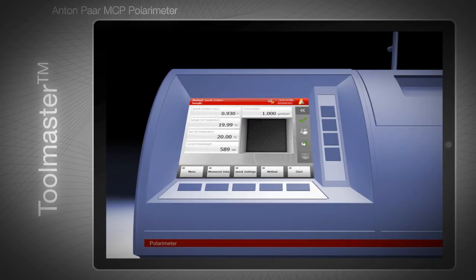During measurement, live temperature data from inside the cell is transferred wirelessly to the instrument. For more information, please refer to the video about MCP's temperature control and measurement.